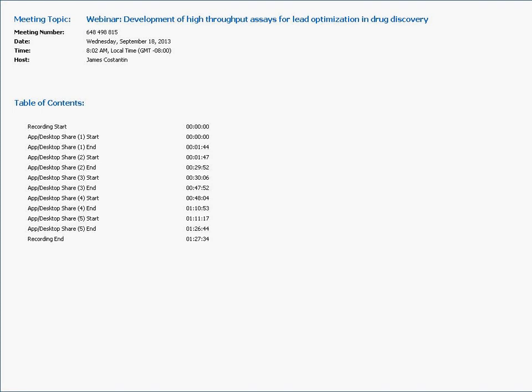This is an example of what temperature control can do. This is a hERG channel using erythromycin as our test compound. To the left, you see erythromycin delivered at 22 degrees Celsius, and you can see that we see very little effect of erythromycin up until we hit 1 millimolar, which is an extremely high concentration. Next, if we heat the system up, initially we see an increase in current of about 40%. Then, as we deliver erythromycin, erythromycin is much more active at physiological temperature.